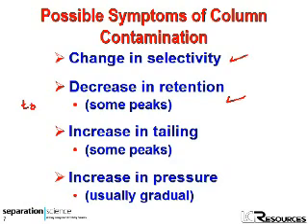Okay, and specifically if we're seeing the same percentage change, a proportional change in the retention time, T sub r, and in T0, that means it's not a chemical problem, it's a physical problem. Okay, if some peaks are changing their retention time but others are not, that's not a physical problem, that's a chemical problem. Increase in tailing, okay, or peak shape problems generally.